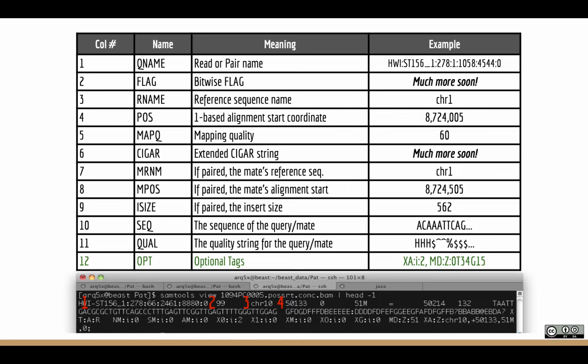Okay, questions? Yeah. So you said there's 51 matches. Yep. But is that pretty good, or why is the score so low? Yeah, that's a great question. There's 51 matches, so you might think that should be a very high mapping quality. But those matches are the alignment, the nucleotide by nucleotide alignment.